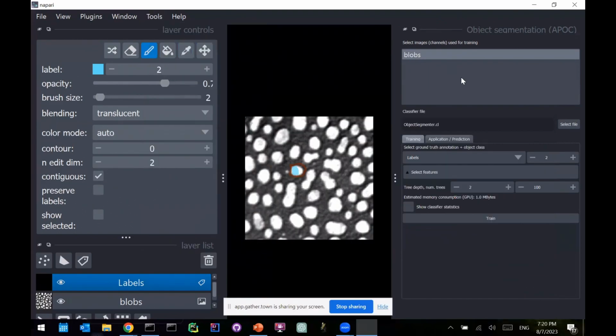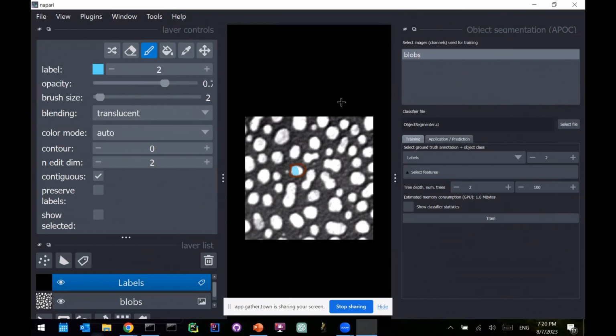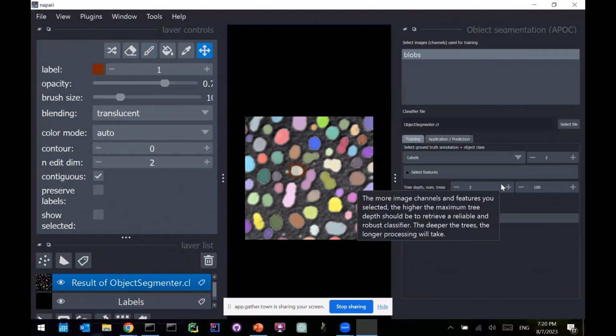So this is pretty much a tool like in ImageJ, we call it Weka trainable segmentation. Some people know Ilastik. So these are machine learning tools for training a random forest classifier, for identifying objects, for differentiating foreground and background in this case. So when you have this tool open, select the image here, which should be processed. And in this pull down, please select your annotation you have been drawing. And when you click on train, it should, after a second, come up with a segmentation.